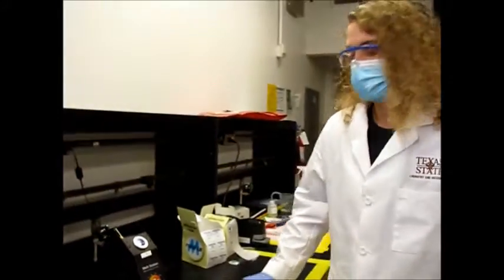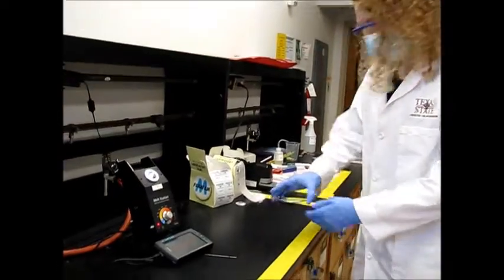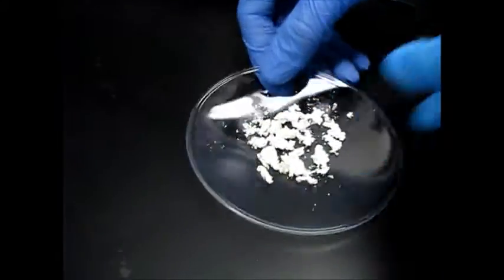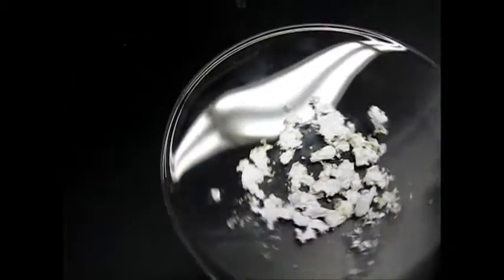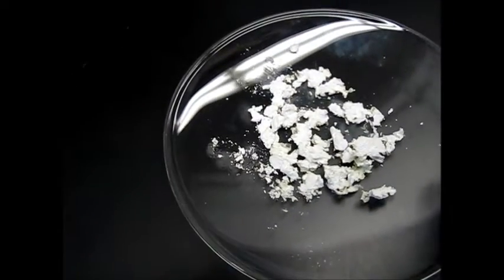That calls into question the purity of our product. Not to mention, if you look at our product, we do still have some yellow in the product, and the product's supposed to be only white. All of this slight yellow that you see is unreacted 9-fluorenone. So that could be why we have that weird melting point range and it being so high.